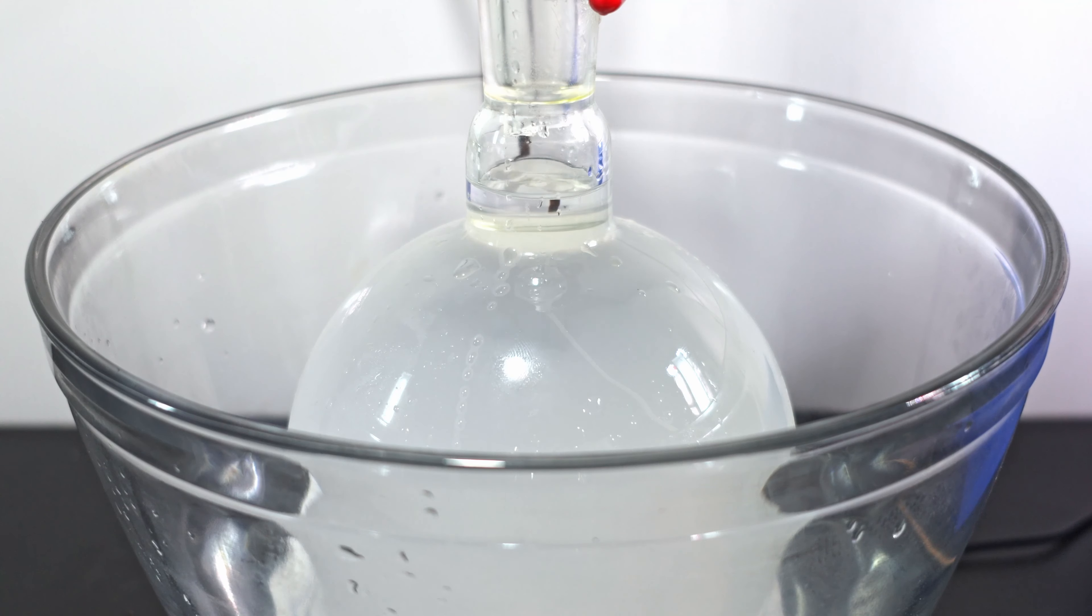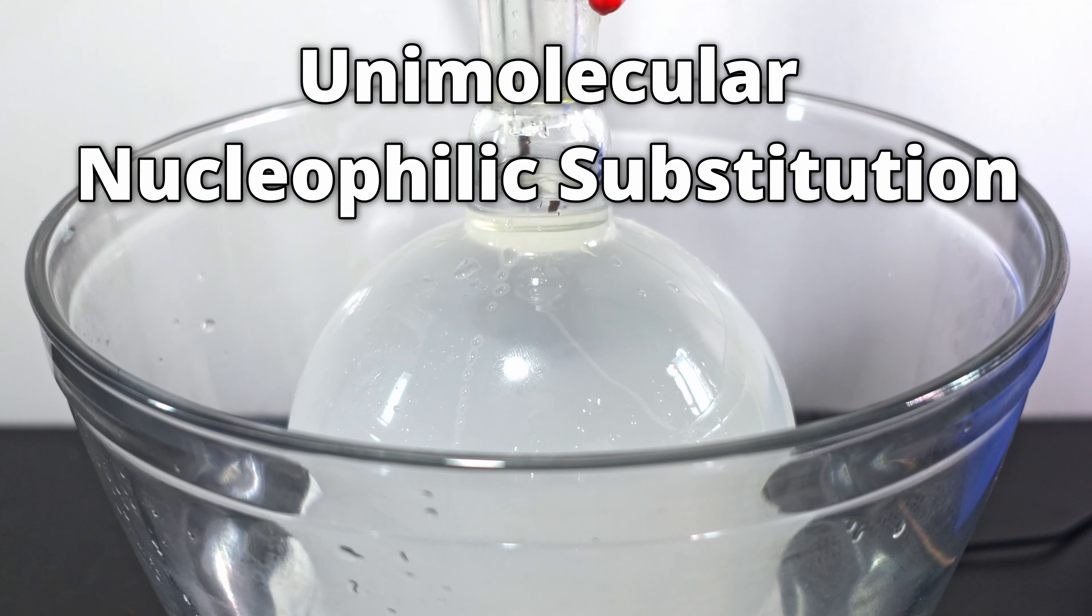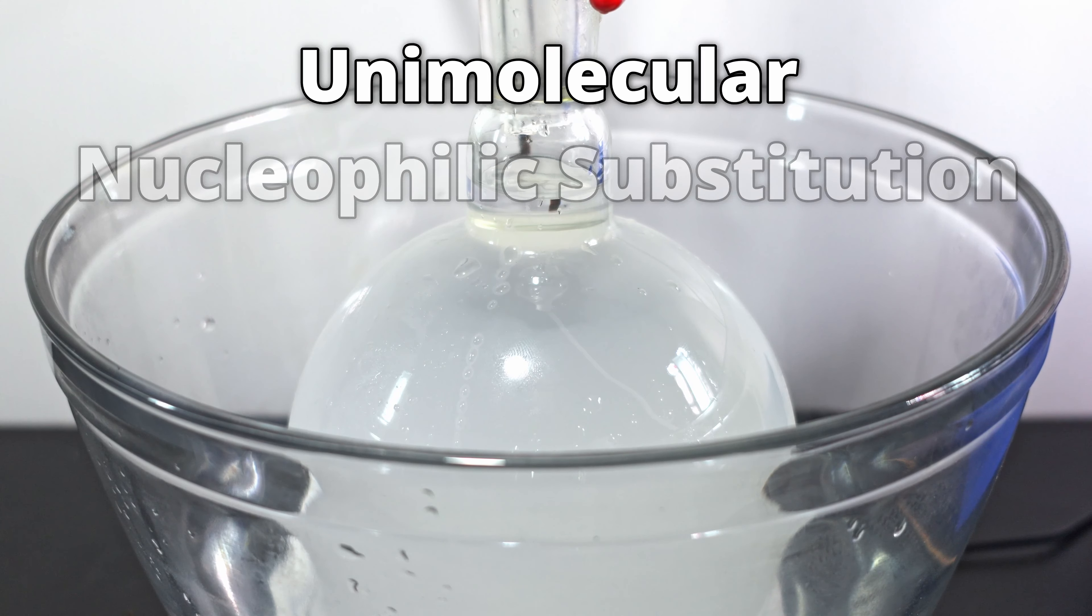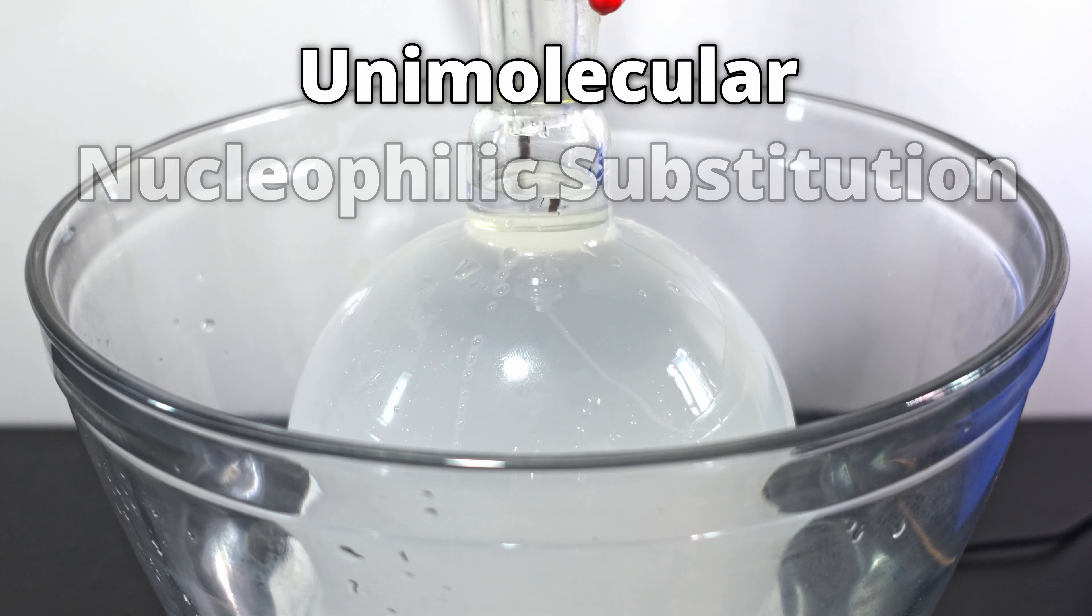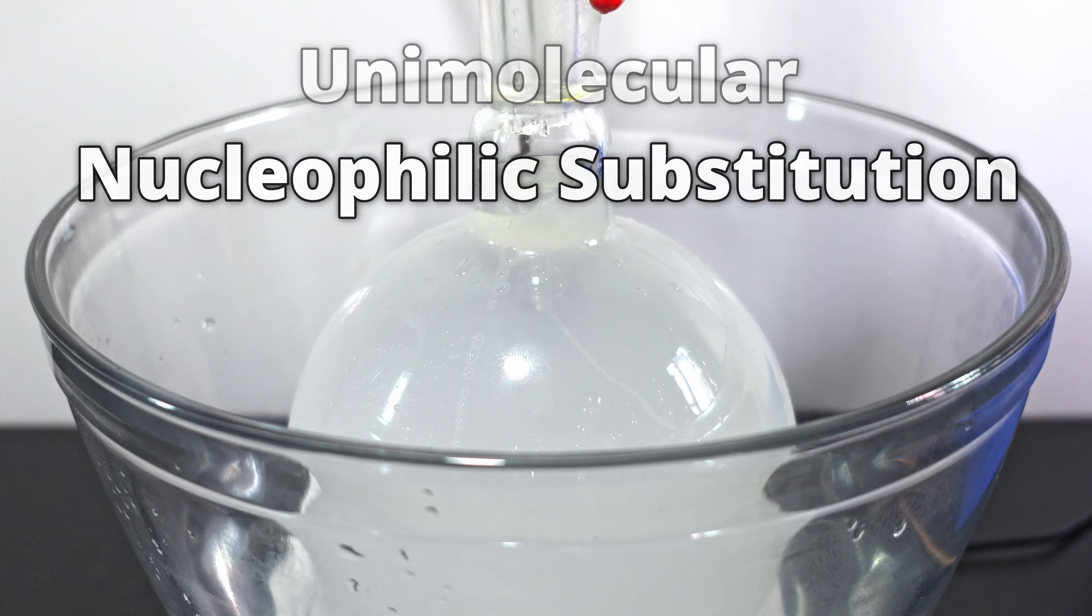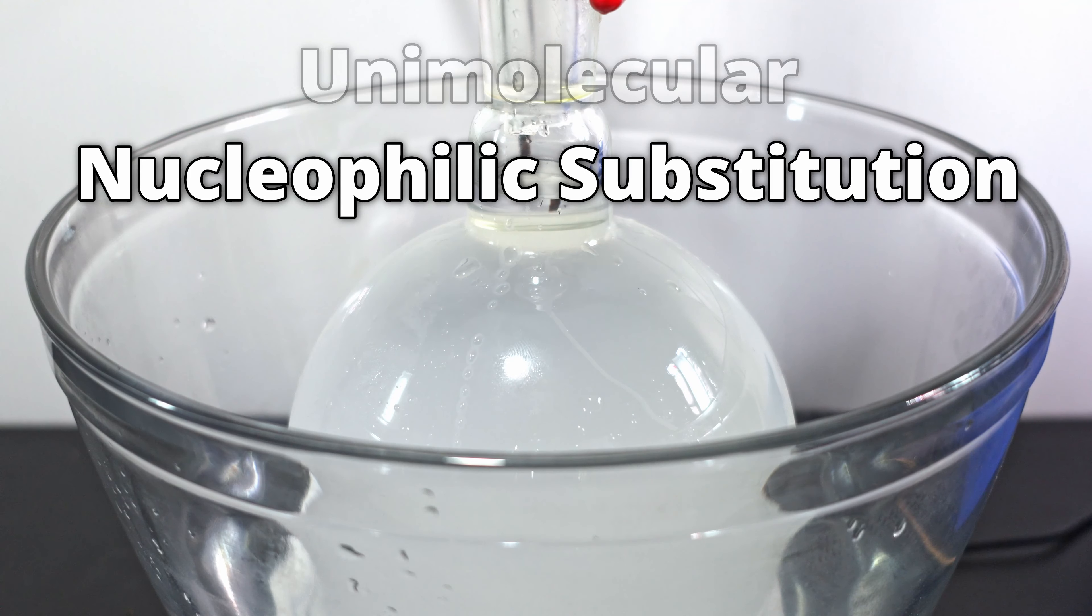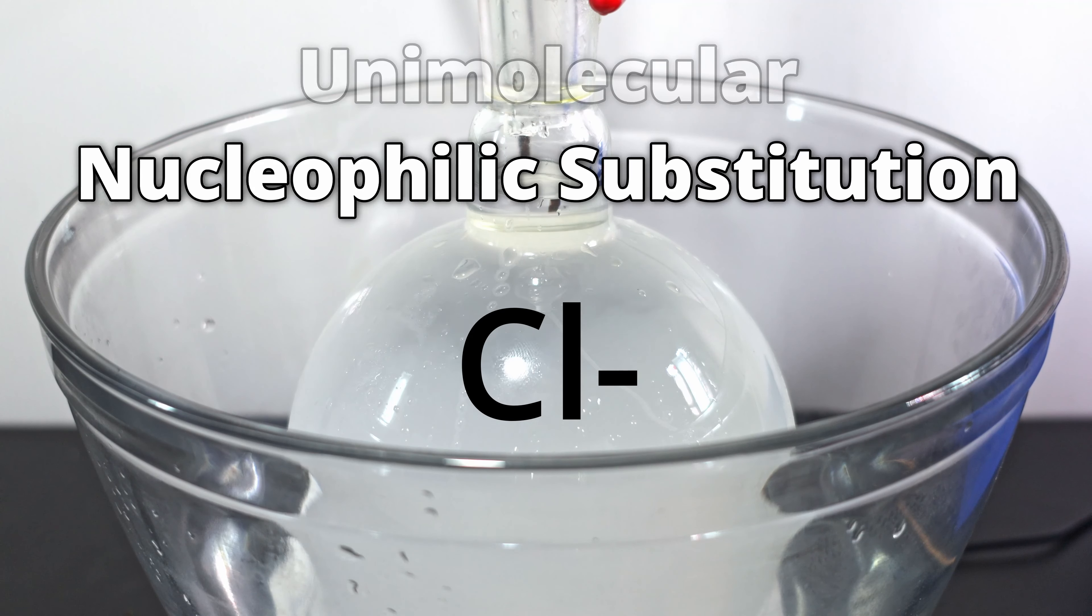What's happening in this flask is an SN1 reaction, or a unimolecular nucleophilic substitution. Big word, I know, so let me break it down. The unimolecular means the reaction rate is only affected by the amount of one reactant, in this case tert-butanol, as it is the molecule being transformed. Nucleophilic substitution means a negatively charged species, in this case the chloride ion, displaces a lesser charged species, in this case water.